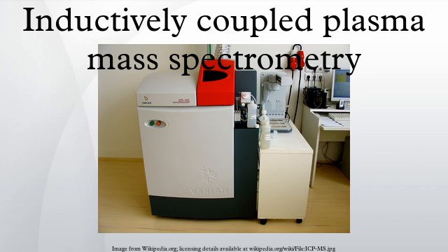Argon can be purchased for use with the ICP-MS in either a refrigerated liquid or a gas form. However, it is important to note that whichever form of argon purchased, it should have a guaranteed purity of 99.9% argon at a minimum. It is important to determine which type of argon will be best suited for the specific situation. Liquid argon is typically cheaper and can be stored in a greater quantity as opposed to the gas form, which is more expensive and takes up more tank space.